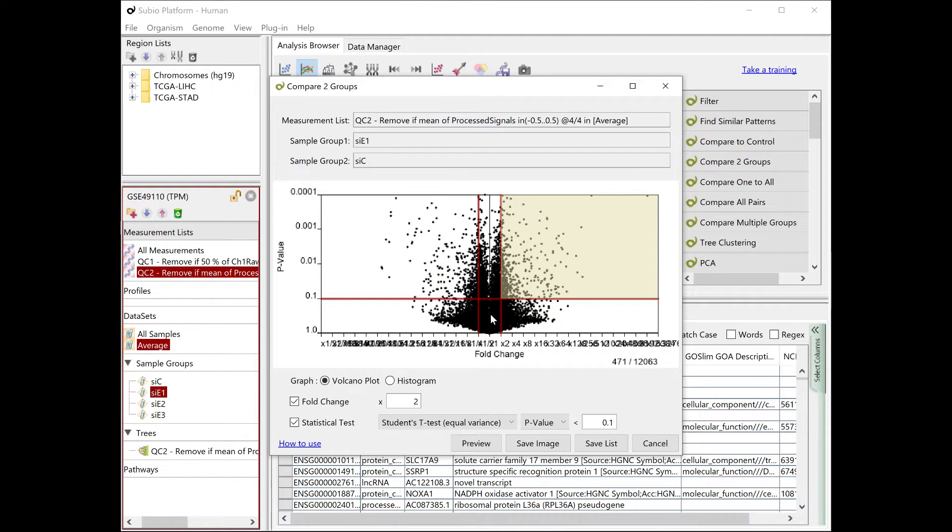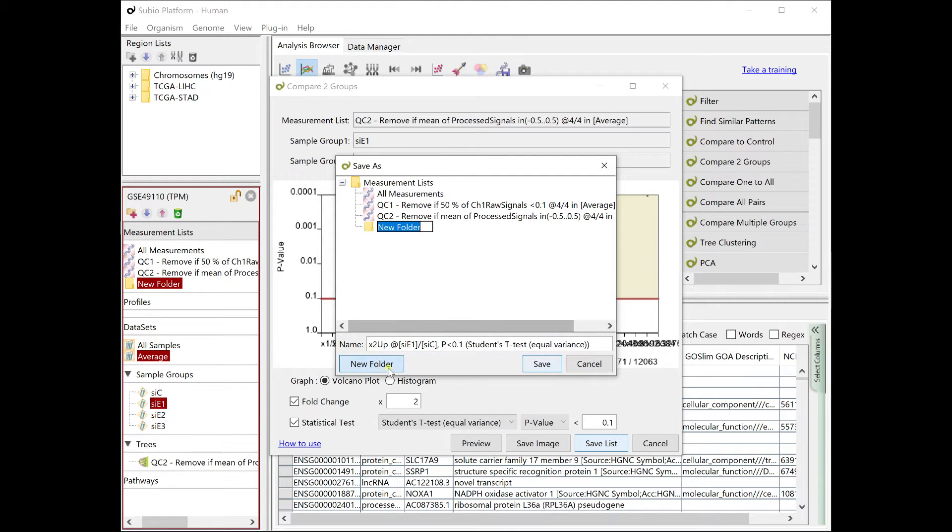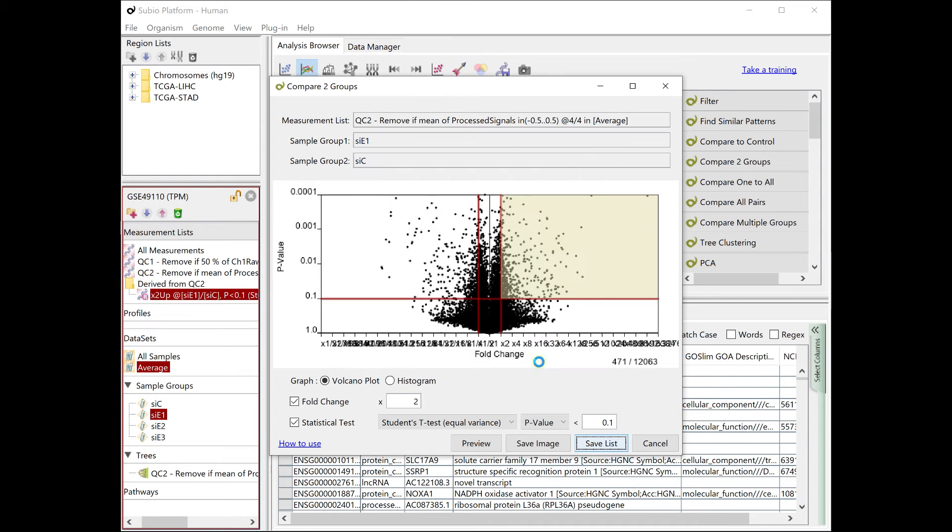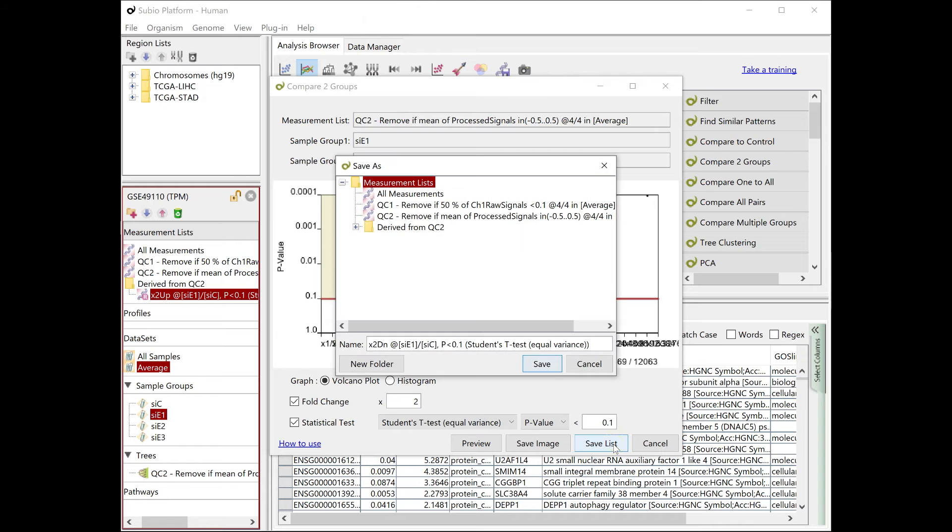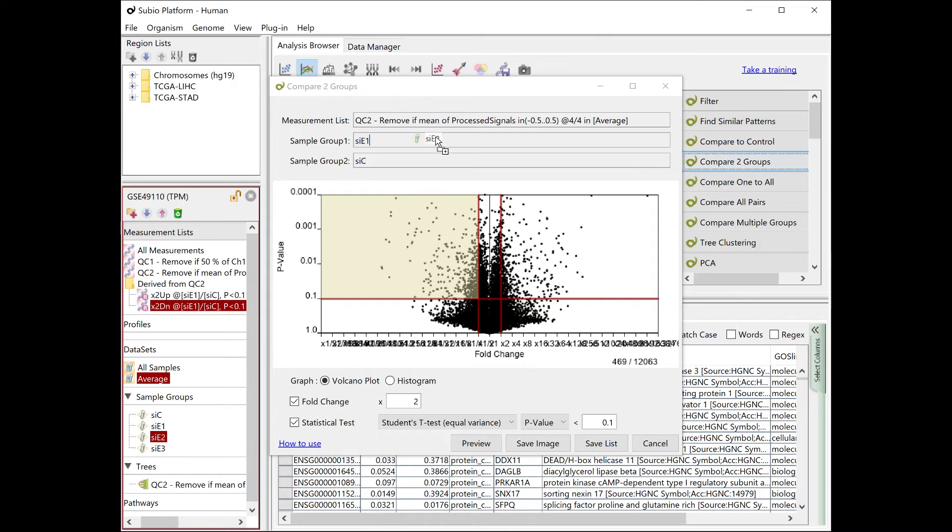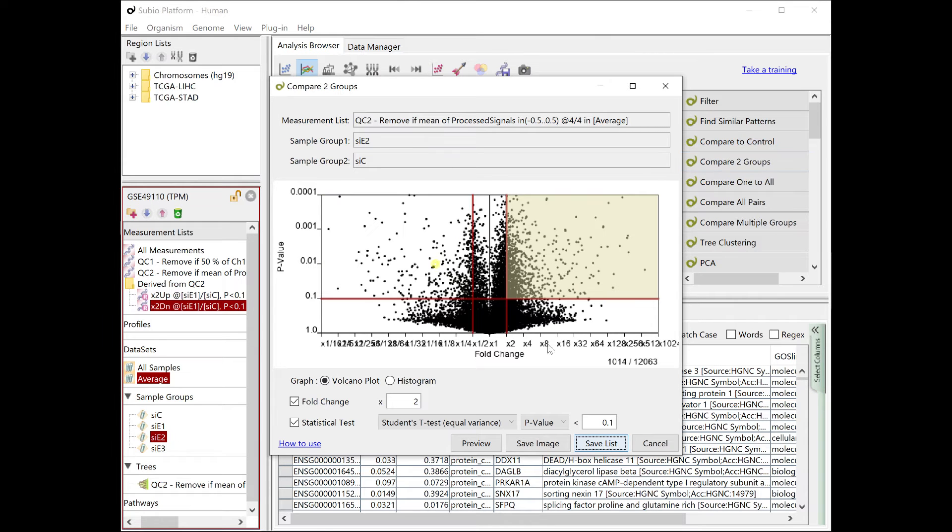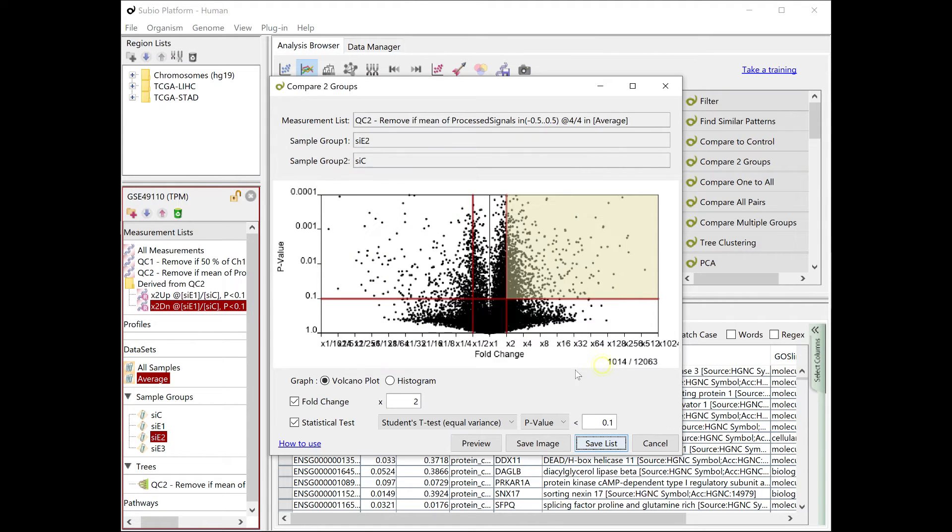Since it was extracted from the QC2 list, create a folder named derived from QC2 and save it in it. Next, we can extract the genes whose expression is altered in CE2, which we will omit here.